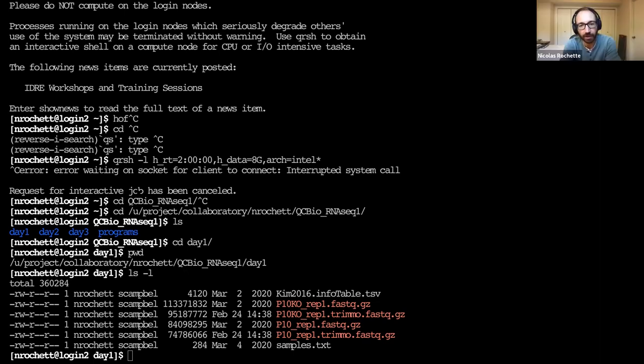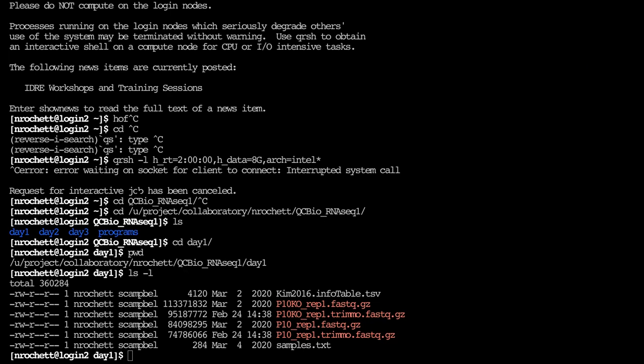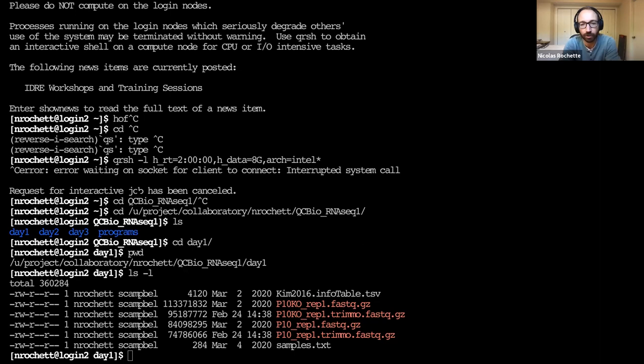To some extent you can share the database. But the database is going to depend on Ensembl, which releases new versions with updates to human and mouse gene annotations every year or even more often than this. So it's just not feasible for STAR to provide a database for every single version of the human and mouse genomes and every other genome that can be out there. It's simpler to let people create their own database. It's not a very big effort either.